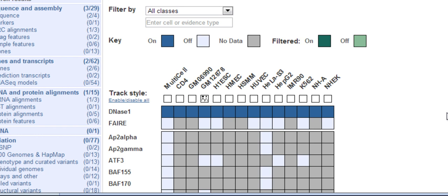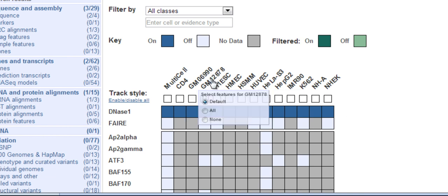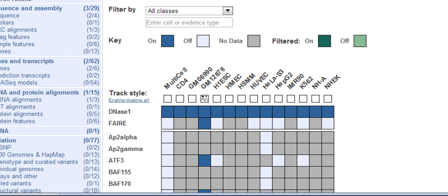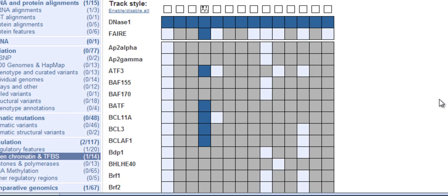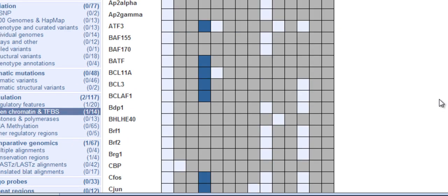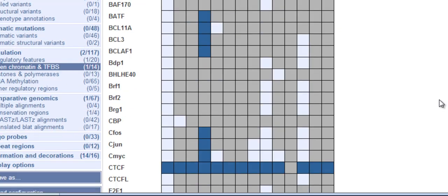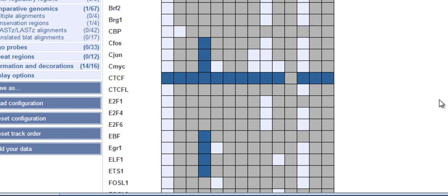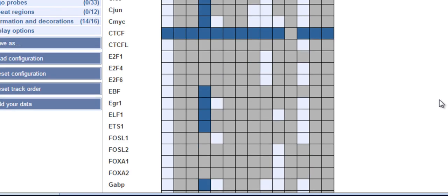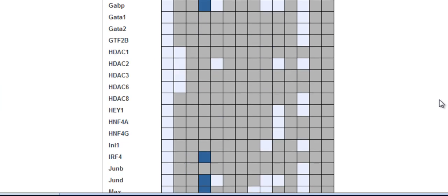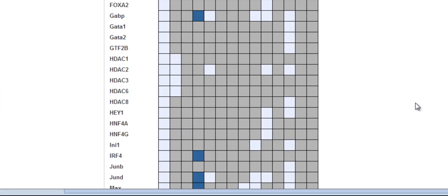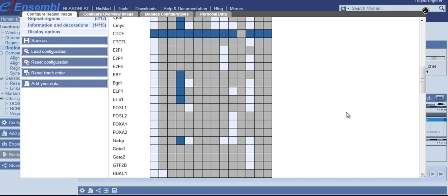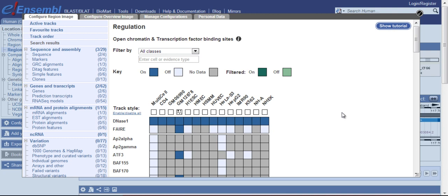To turn on all possible data for GM12878, I hover over the label and select all. Now all the data boxes available turned blue are switched on. OK, let's close the menu and see what we get.